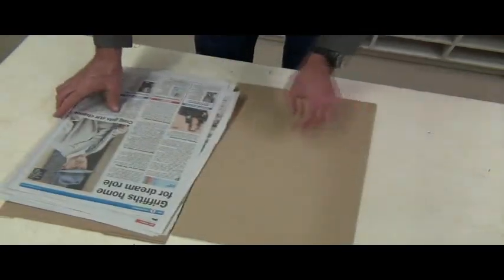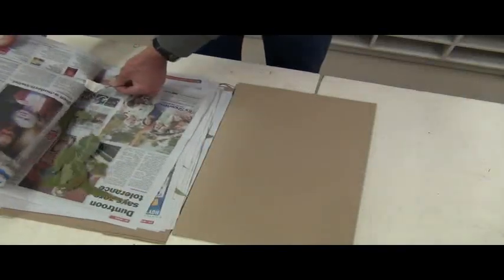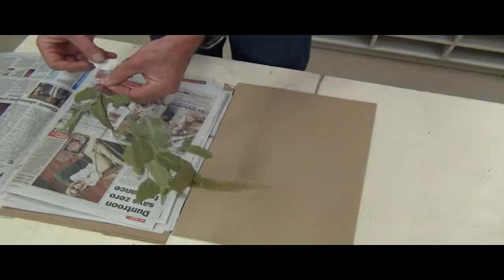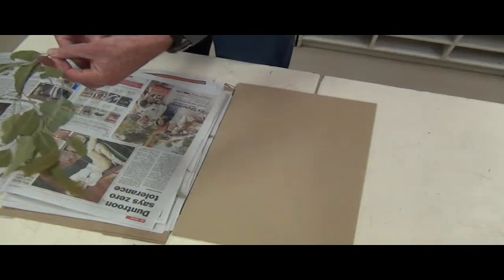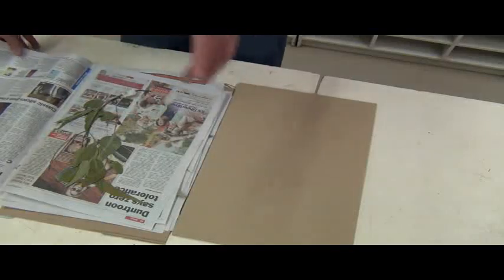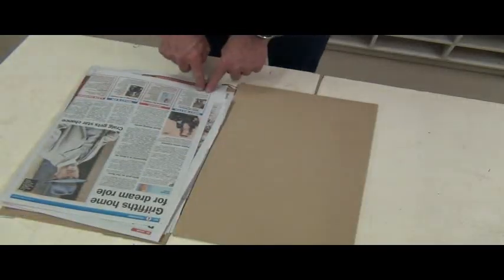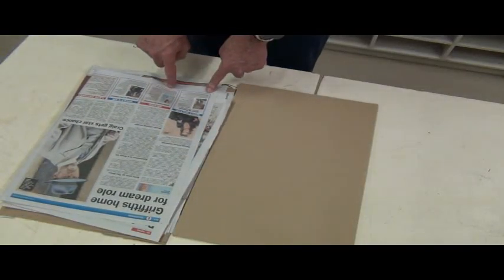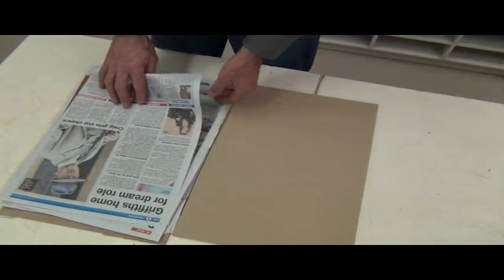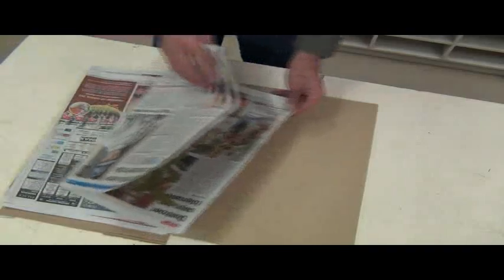Sam forgot his jeweler's tags and so decided to use masking tags. Can I suggest you take that off. If I'm in a situation where I run out of collecting tags, then I will write on the bottom of the sheet — I will write the collector's name and number. But of course there's a real risk that if you start swapping papers that everything gets confused, so I don't recommend that, but in a case like this, that would have been a better, quicker, simpler solution.